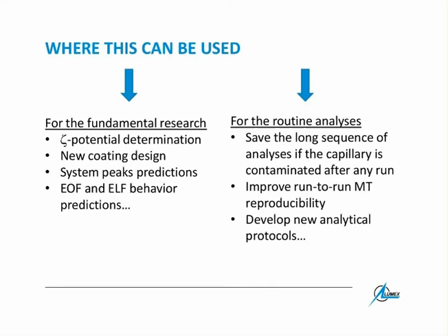One part is 23 centimeters from the inlet to the detector point. Another part is 7 centimeters from the detector point to the outlet. And you can inject your sample actually from any of these ends, from the inlet or from the outlet. Why? Because if you inject it as usually, typically done from the inlet, from the left side, you have 23 centimeters effective length. And the separation of all the components of your sample occurs in this 23 centimeters.